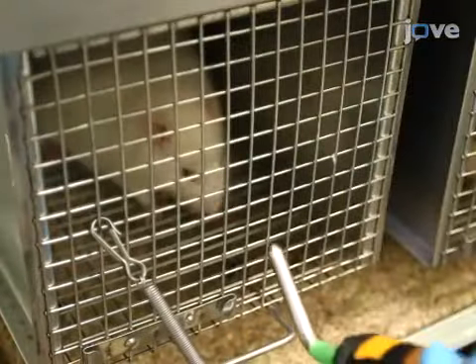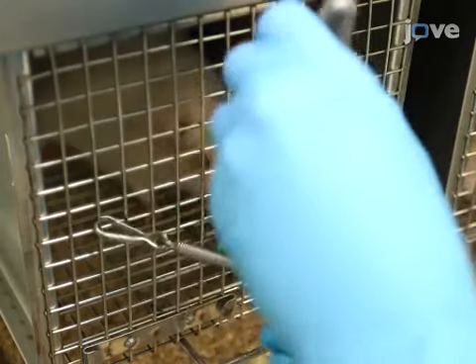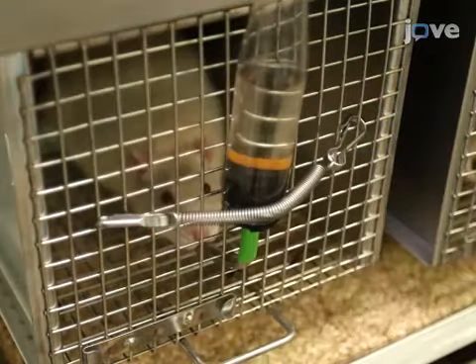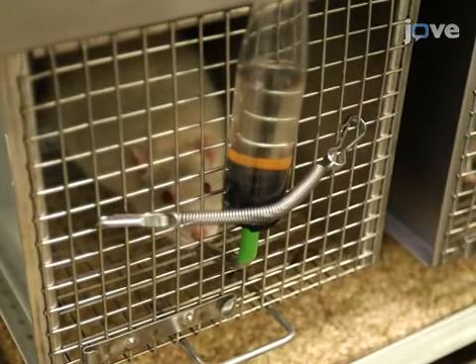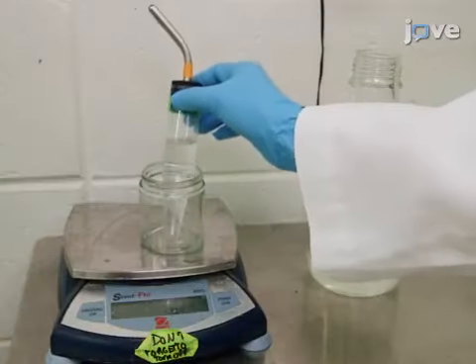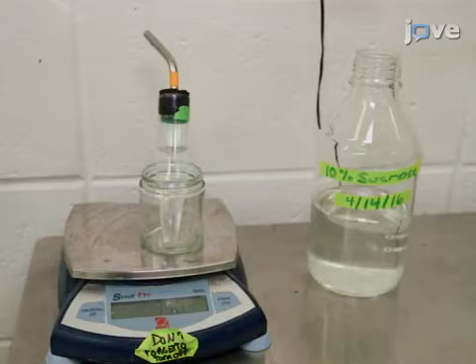In the meantime, provide 10 mL of pre-training solution with 0.2% saccharine to the animal for four days over a one-hour session to maximize the probability that the rat will sample the subsequent test solution with short latency. Weigh the tube before and after each session to obtain the intake measurement.